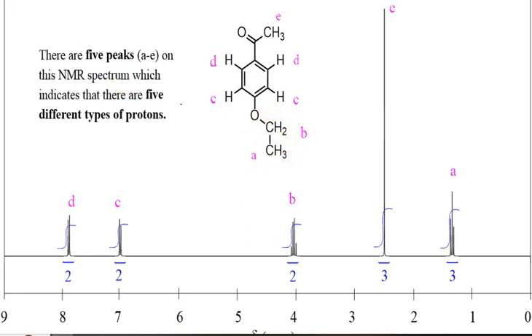So the splitting pattern is how the signals can split. Basically, if a nucleus displays a signal in an NMR spectrum, the number of adjacent nuclei around it, that is on the next carbon that holds that nucleus, can split it. It can split because their magnetic fields can interact. The interaction between the magnetic fields of adjacent non-equivalent nuclei is what we call coupling, and the coupling can lead to splitting, which is the division of the NMR signal into two or more lines.